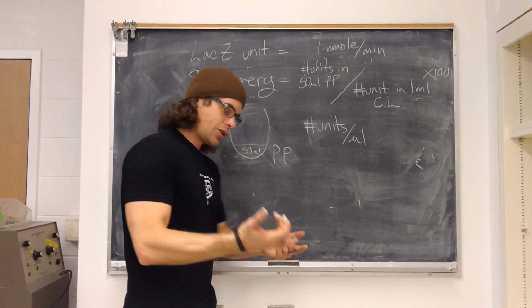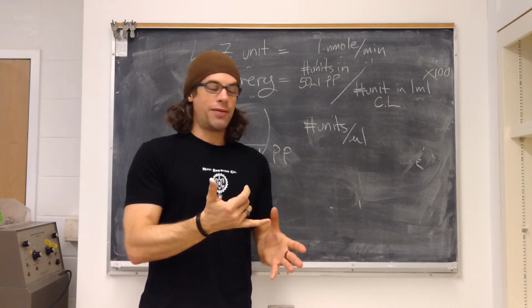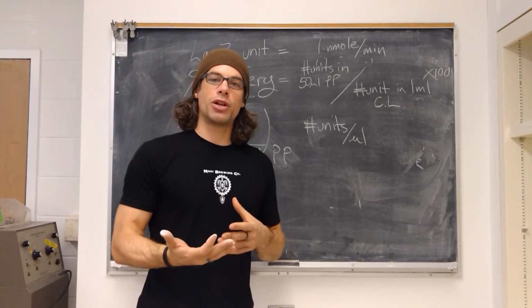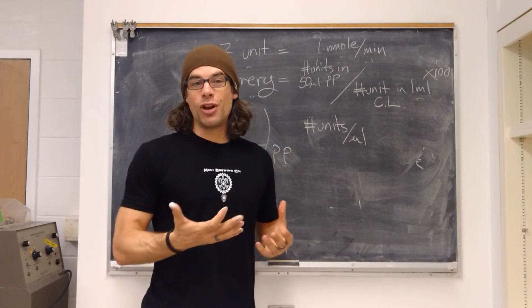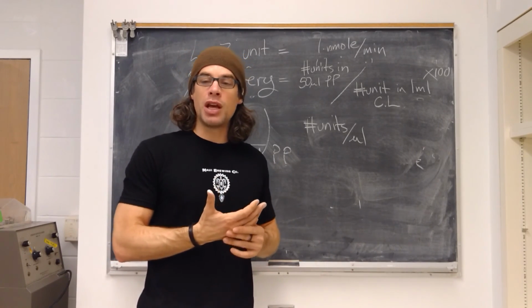And so that runs us through units, specific activity, fold purification and induction, and finally, percent recovery. All of these I'd like to see you incorporate into your results report. They're all good values to calculate when doing recombinant protein extractions. It gives us a very good idea of what kind of success rate we're having with our enzyme extractions and where we might improve.